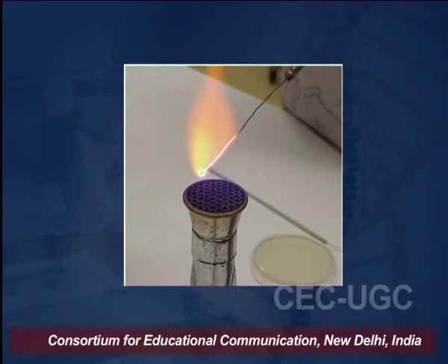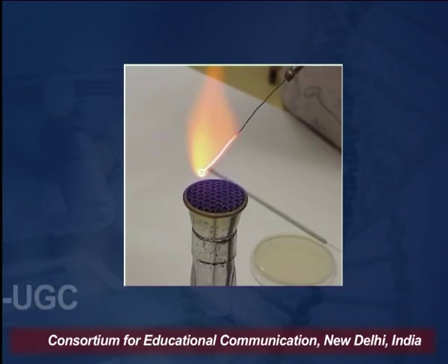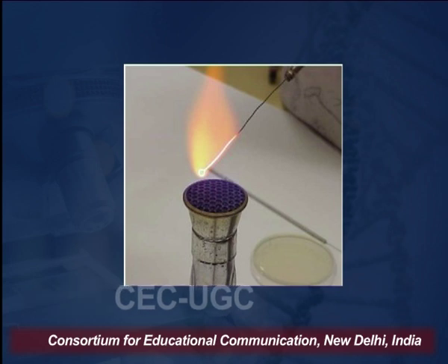And now moving to heat sterilization. As you can see, this is dry heat, because we are using the flame directly to make the rod red hot. Once the rods are red hot, they are cooled down and they are considered fully sterile.